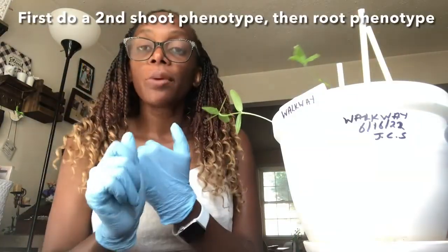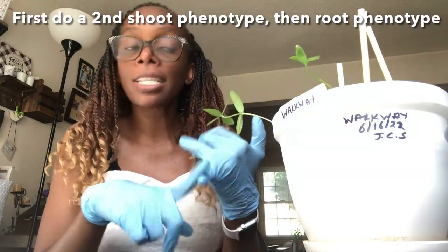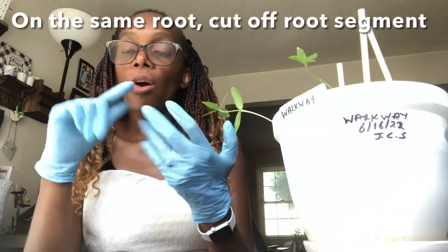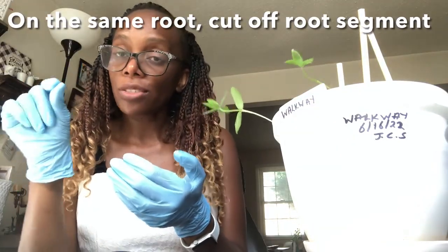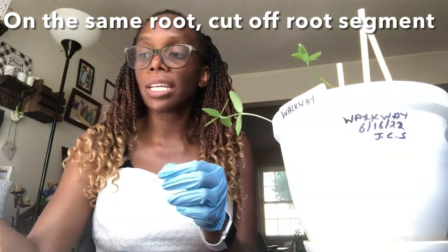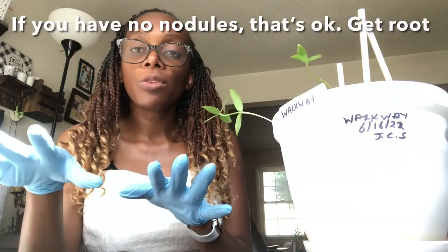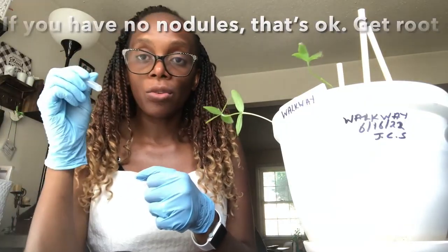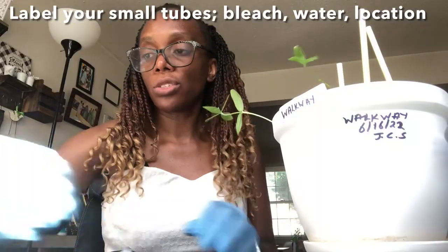We need to get our plants, and the first thing we have to do is a shoot phenotype. You already know how to do this. And then do a root phenotype using a microscope, and then on the same root cut off a segment that has nodules, or as many nodules as you can get that will fit into the tube, near the bottom. If you don't have any root nodules, just get a big enough segment, and then you add it in your tube. Okay. So first things first, let's label our tubes.